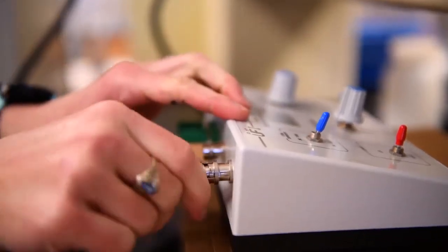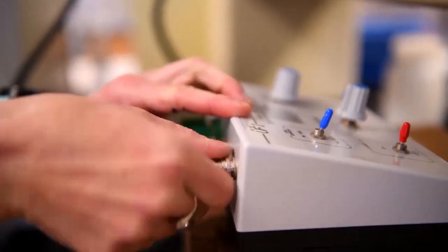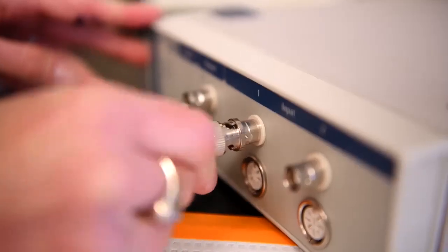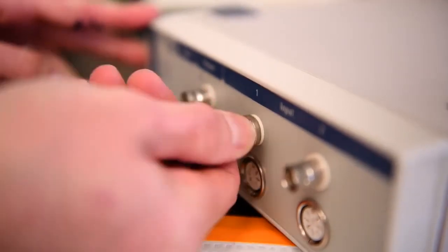Set up the impedance converter by plugging in the black BNC cable to the AC output on the unit and connecting it to the power lab data logger using the channel 1 port.